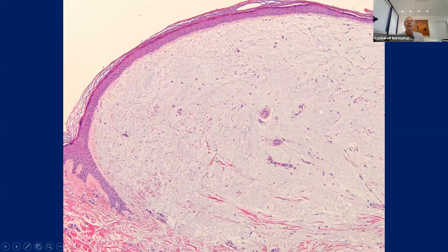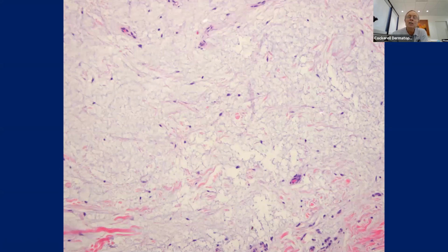And as you go to higher magnification, this is very, very important to make sure you recognize what we're looking at here. This is fundamental for histopathology to know what this material is. So if I were writing a board question, I might flash this up and say, this material is mucin, and what is the actual chemical composition of this material? Yeah, hyaluronic acid.